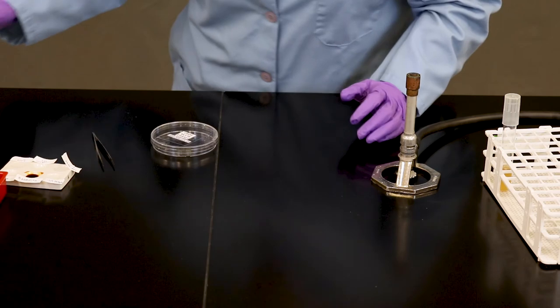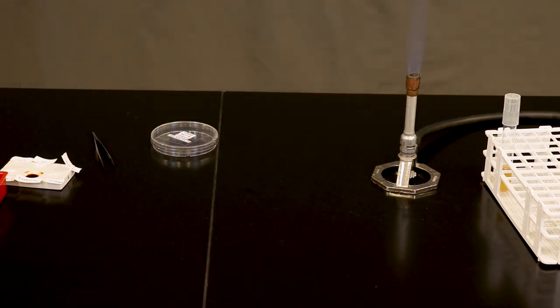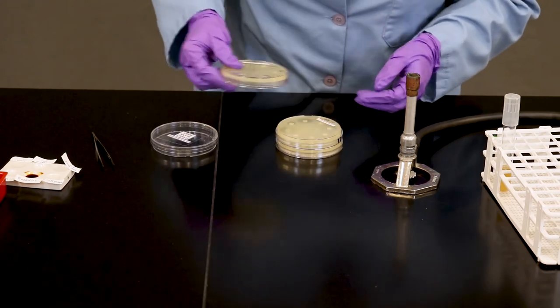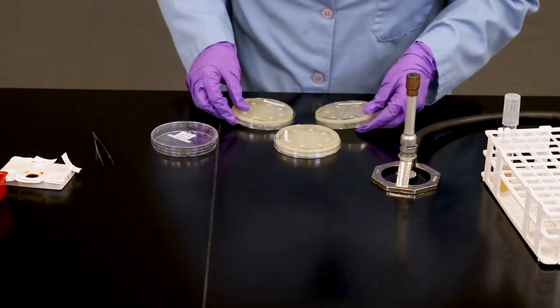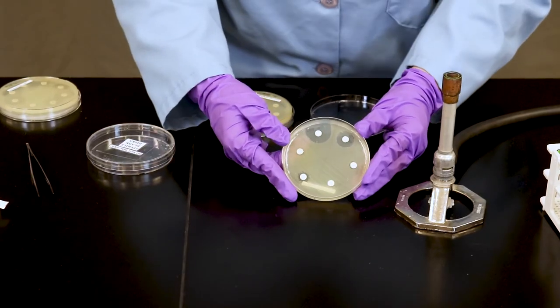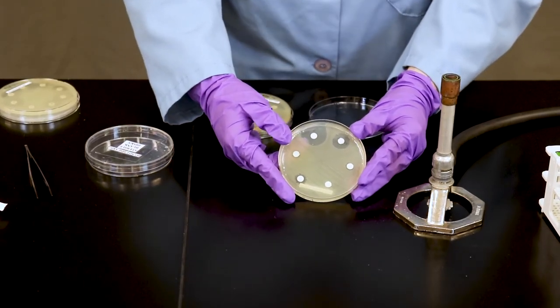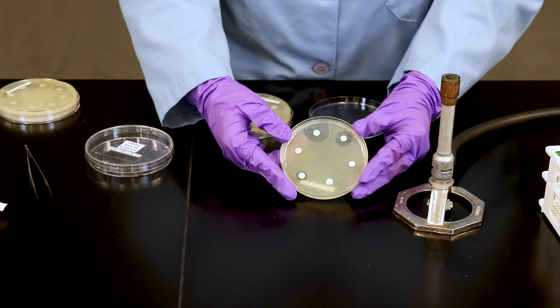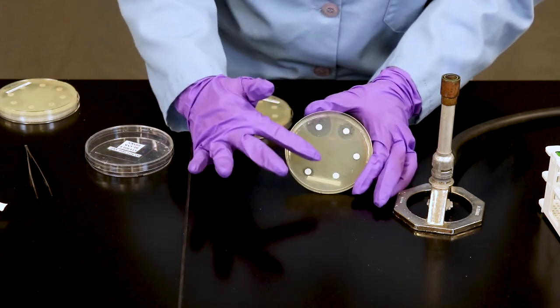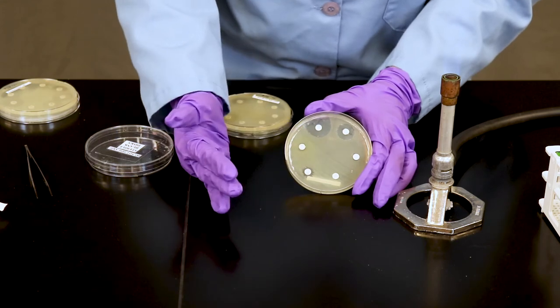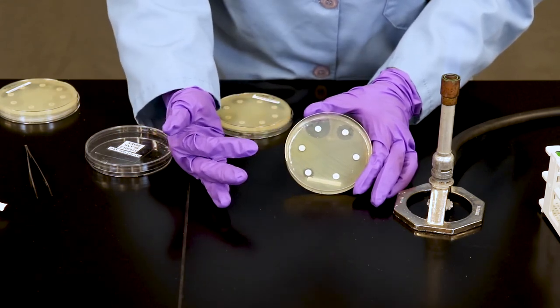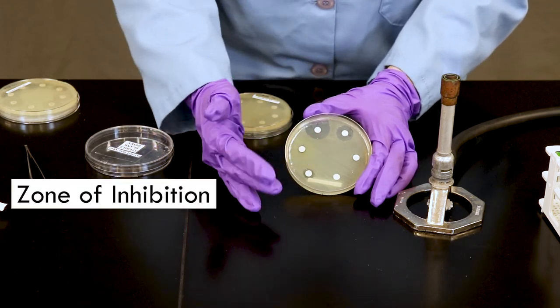And to show you perhaps the final results, and again we'll examine photos of this later. So after 24 hours, maybe up to 48, this is what a final result would look like. You will notice that the bacteria is growing evenly on the surface of the petri plate. You can tell that if a particular chemical agent was effective it will generate what's called a zone of inhibition.